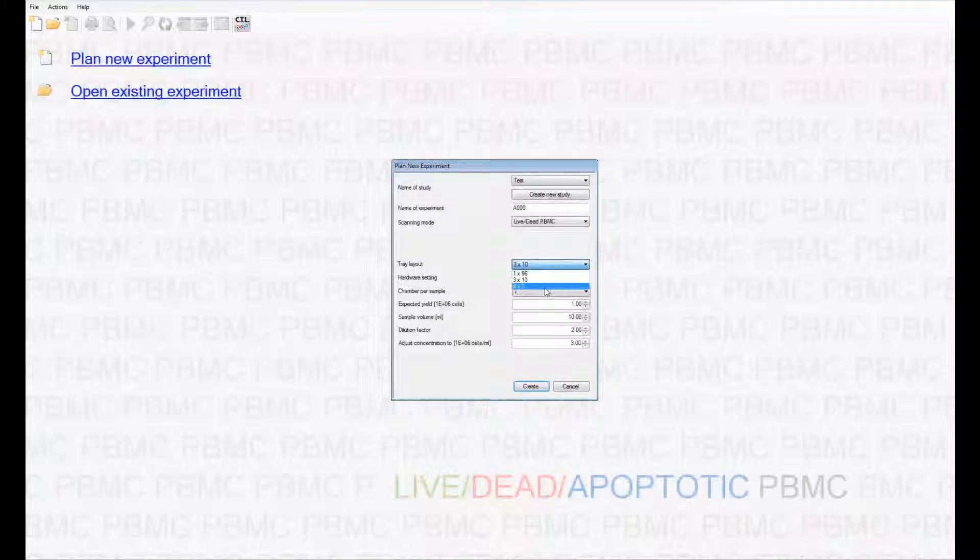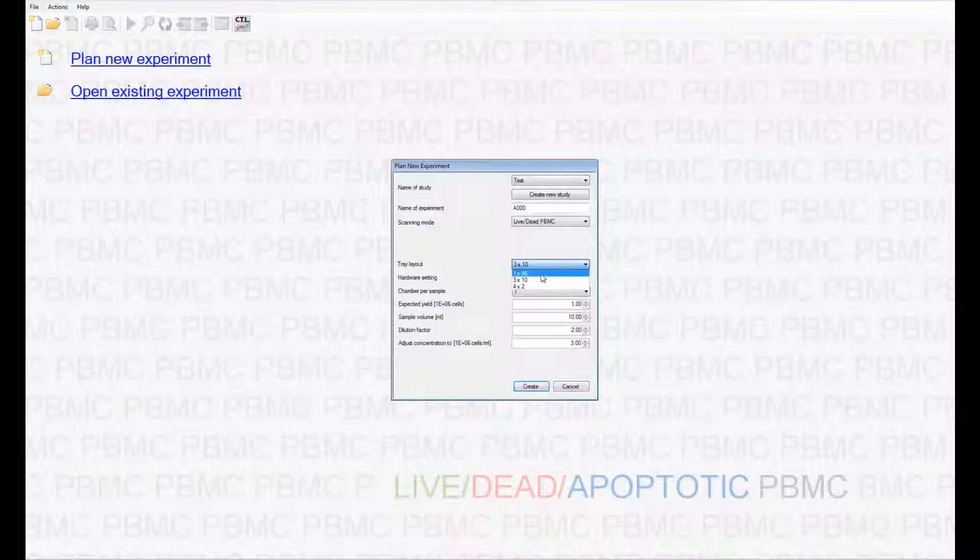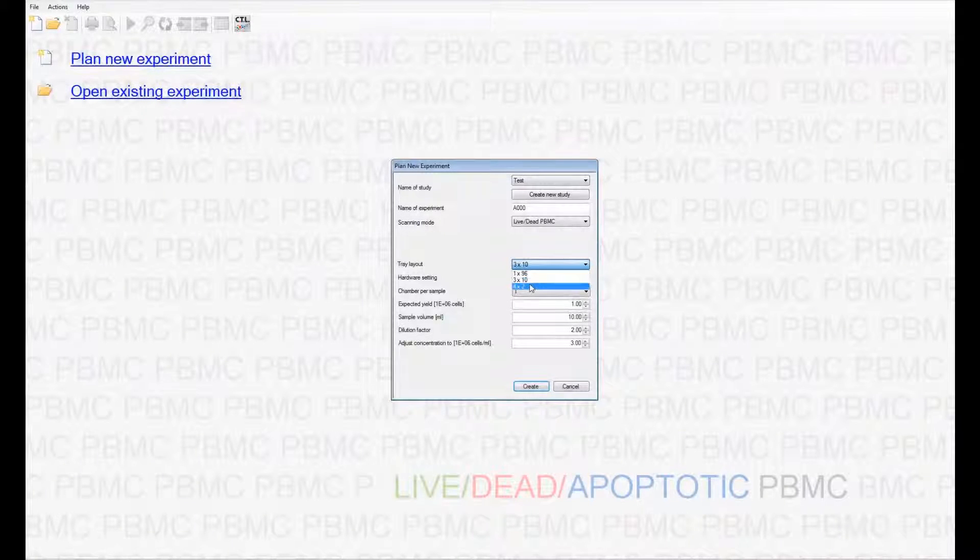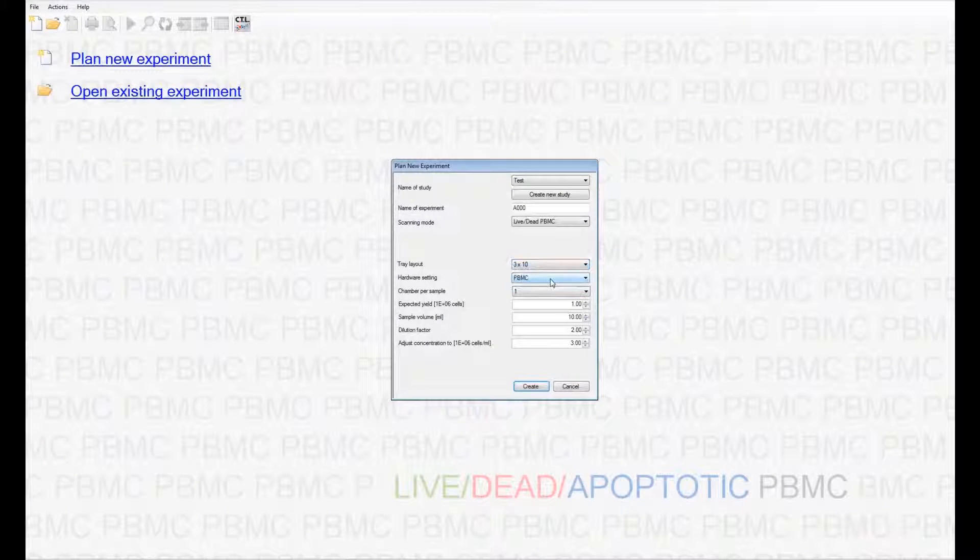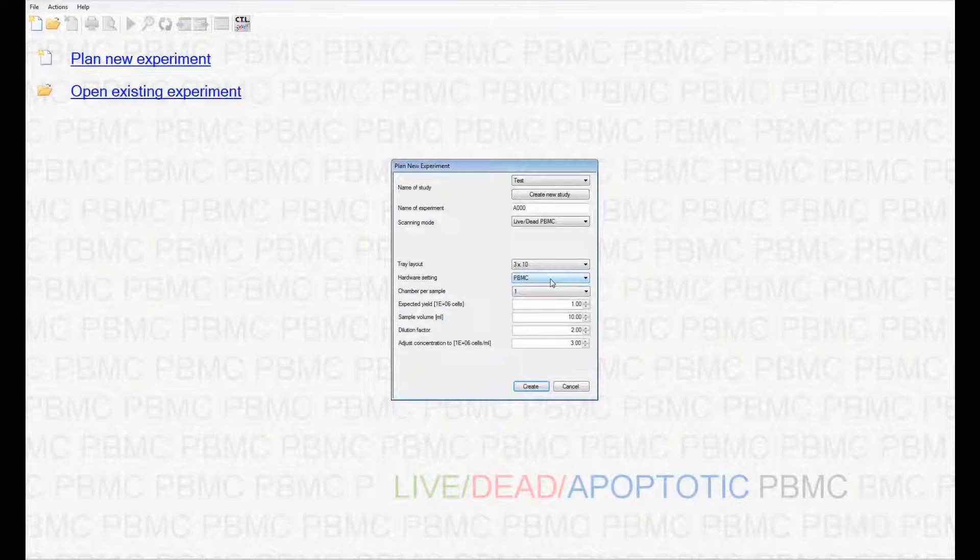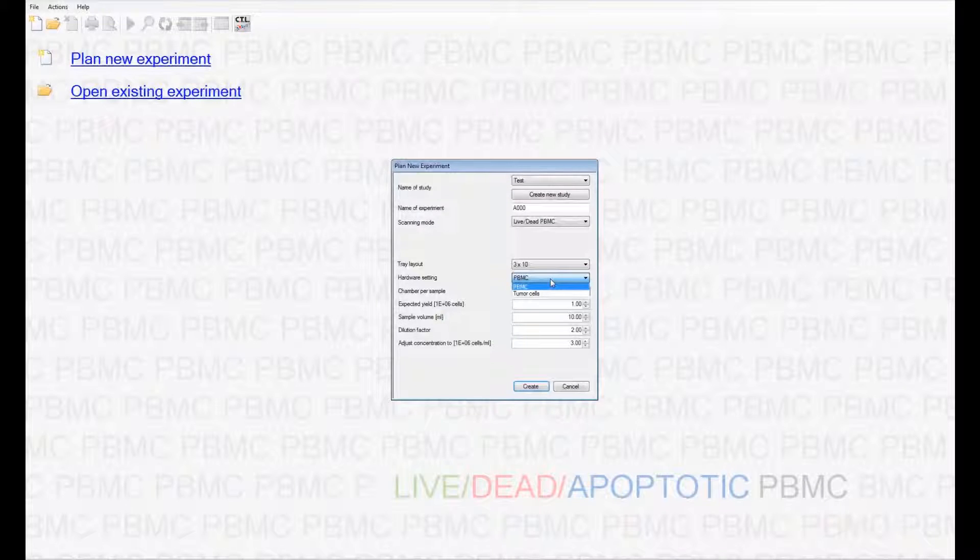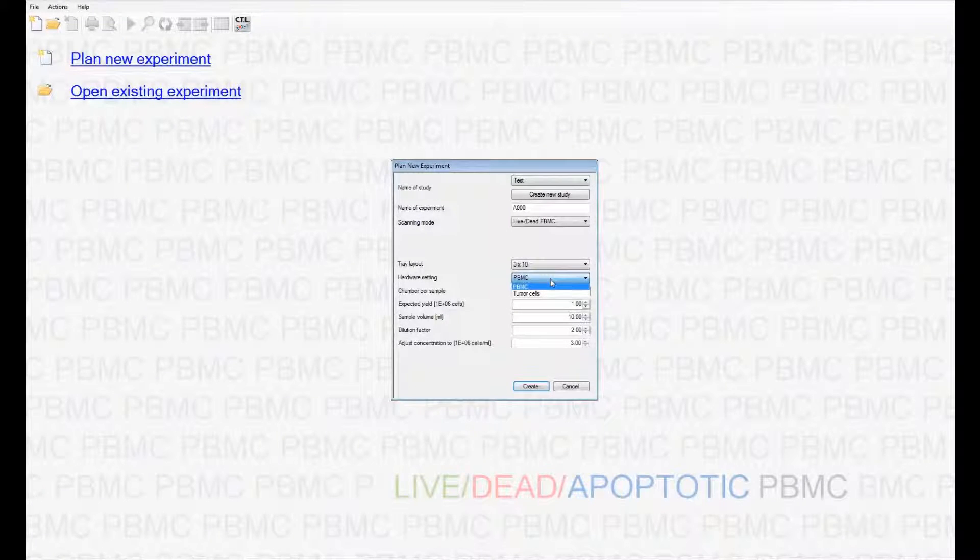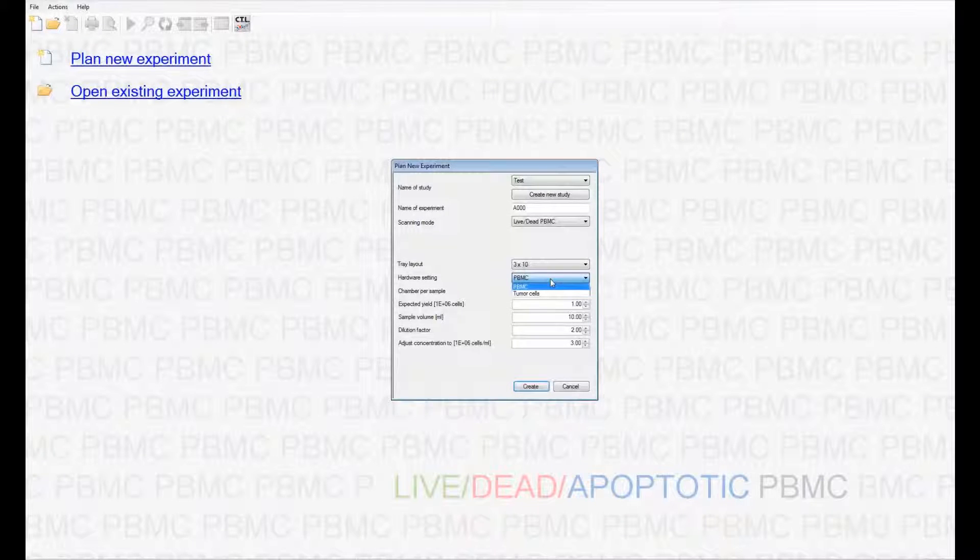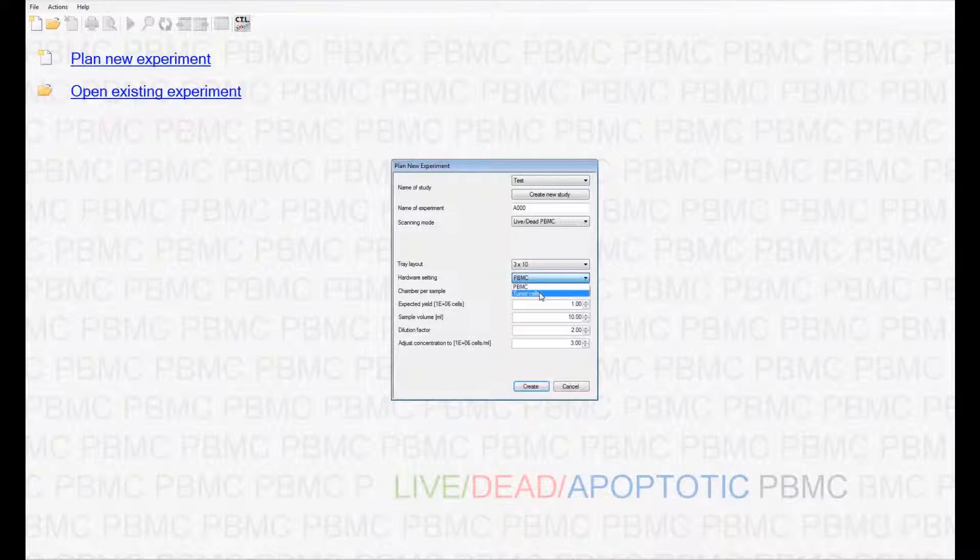Depending on the type of chambers, you can either count 96 samples, 30 samples, or 8 samples per run. The same software can be optimized to count multiple cell types as well. The scanning and counting parameters are set by CTL personnel to accommodate your cell type. For example, I have imaging parameters set for PBMCs as well as for tumor cells.